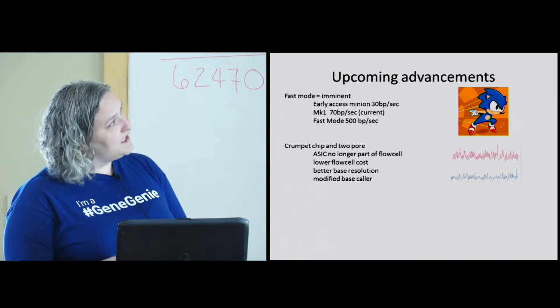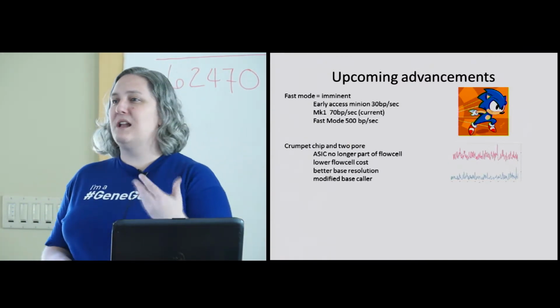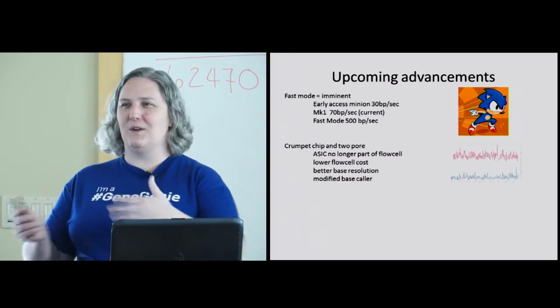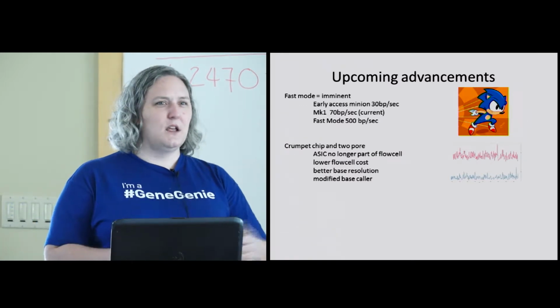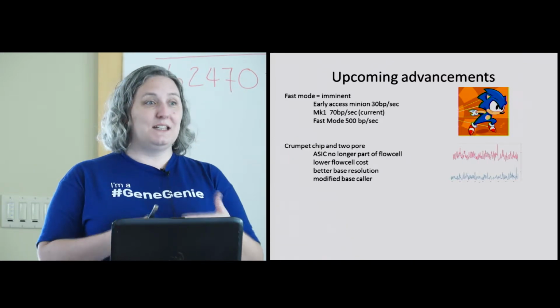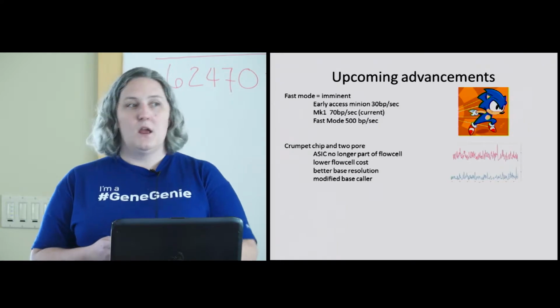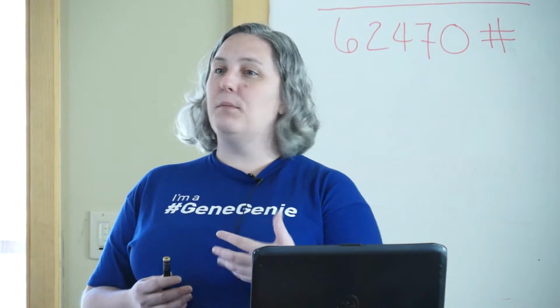The 2-pore system, which is that difficult to see image there, is about all the different proteins they tested. We talked about how graphene pores are inconsistent and they give different signals. But you can intentionally include multiple types of proteins to get different signals to improve your overall resolution. Perhaps some proteins are good at detecting base modifications. Some sequence slowly, some sequence fast. You can group all this data together and potentially get better sequencing performance.